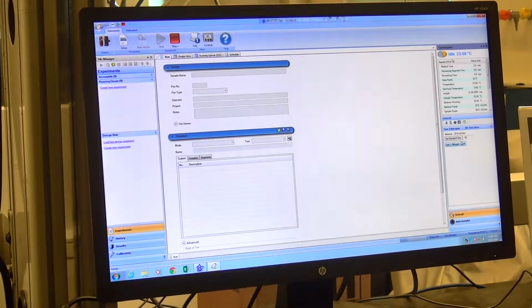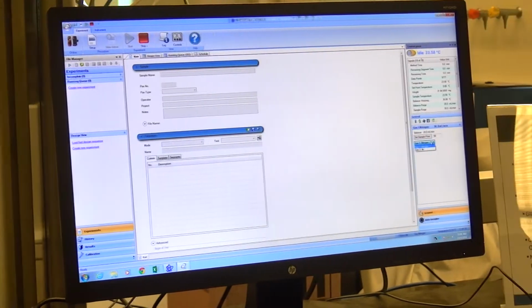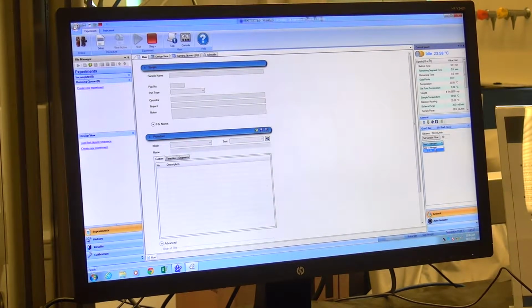All right, so on the right-hand side, like I said, if you want to start with a specific gas, then you need to identify which one it is and make sure that one is selected before you hit start, of course. Our default sample flow right now is 50 milliliters per minute. That can be changed, but so far that's what we've been working with. Otherwise, on this right-hand side, there is not much more you really need to interfere with over here. I'll show you a little bit later on one of the things that may be convenient, especially in terms of sample preparation, that may be on this right-hand side, but otherwise everything else should be exactly the way that it is.